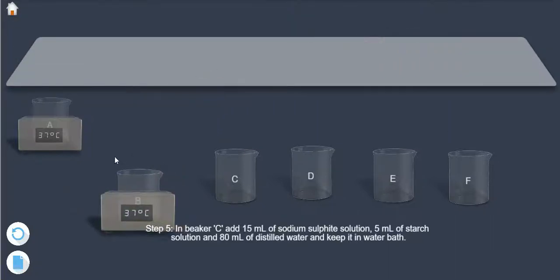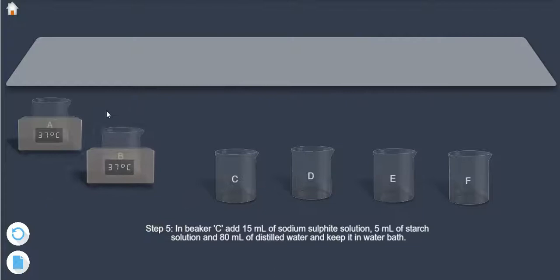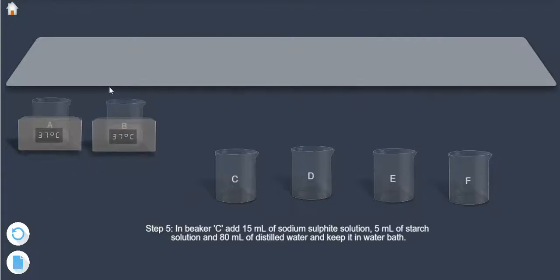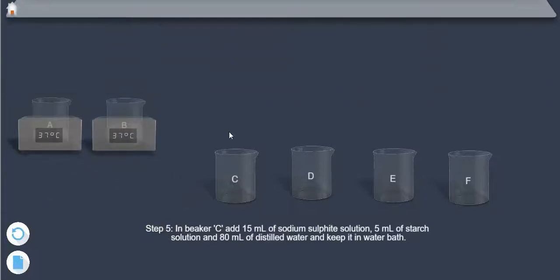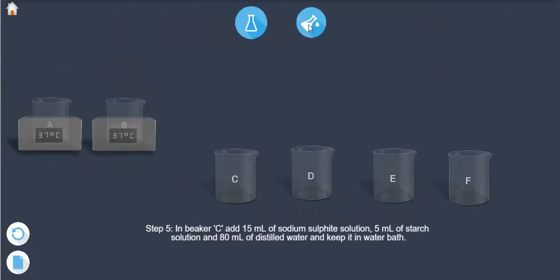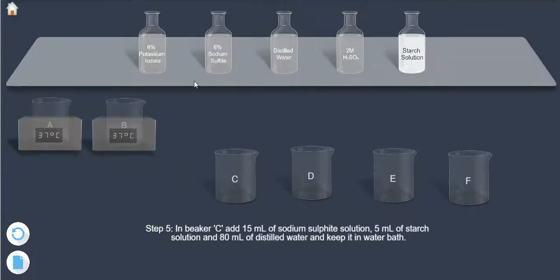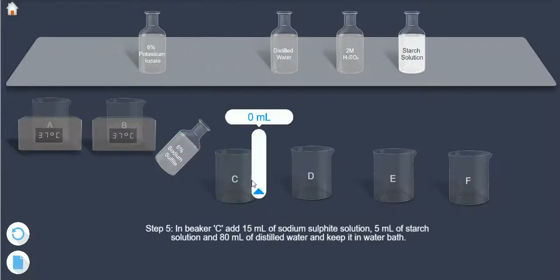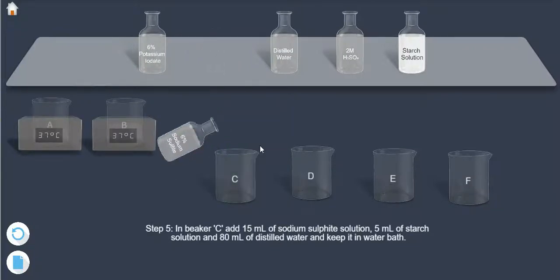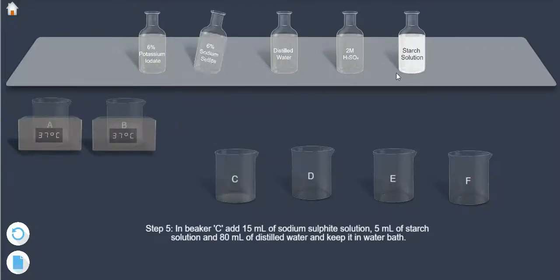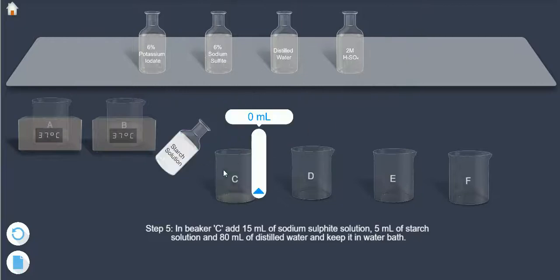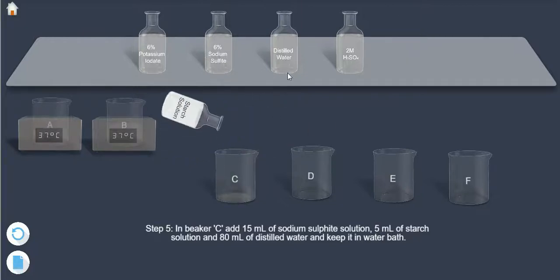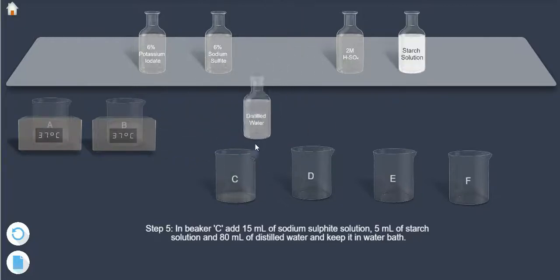Step 5: In beaker C, add 15 ml of sodium sulfite solution, 5 ml of starch solution, and 80 ml of distilled water, and keep it in the water bath.